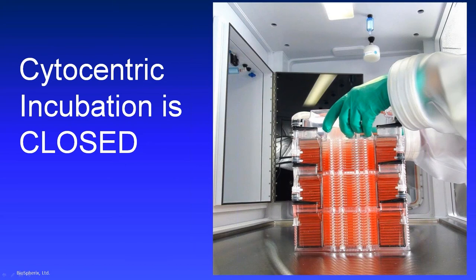Incubation chambers open only into closed cell processing space, like the one you see here. You have constant atmosphere. You can have 37 degrees in that atmosphere. You can have constant HEPA filtration. The gases all come from dry, compressed tanks, so there's no room air inside this system.